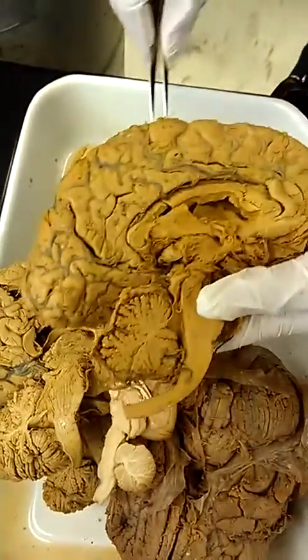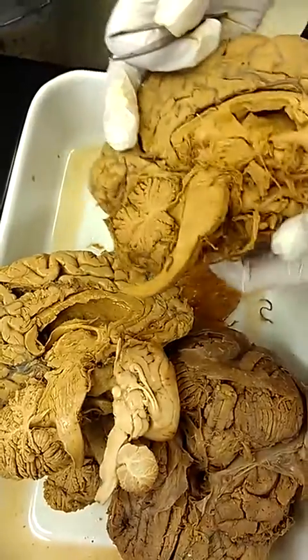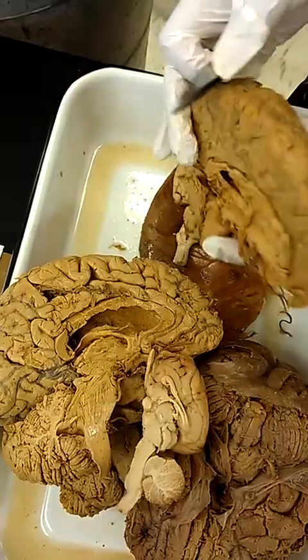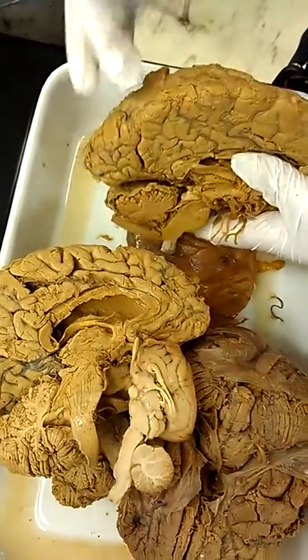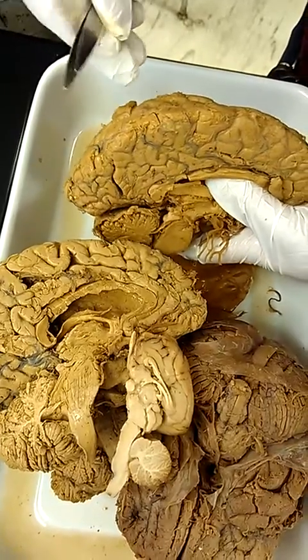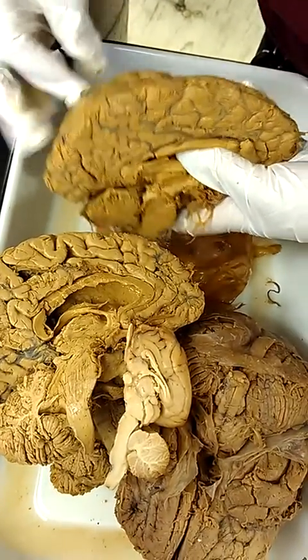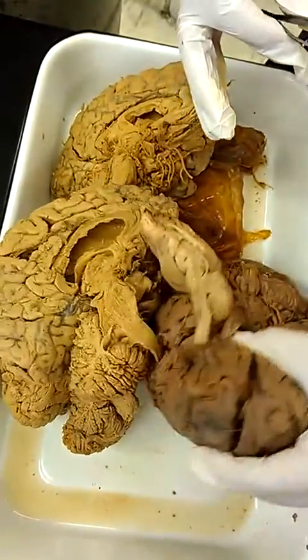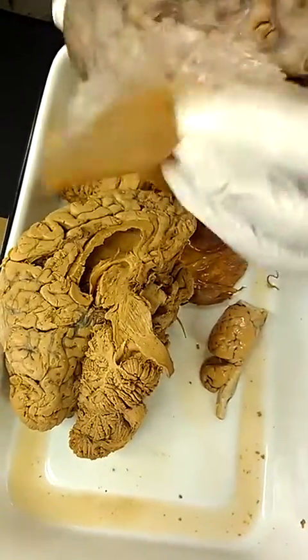Okay. So that's the whole thing for the sheep brain, and then in the human brain, we already went over the central sulcus, which is the border for the frontal lobe, and then the primary somatosensory cortex. They're on opposite sides of the central sulcus.